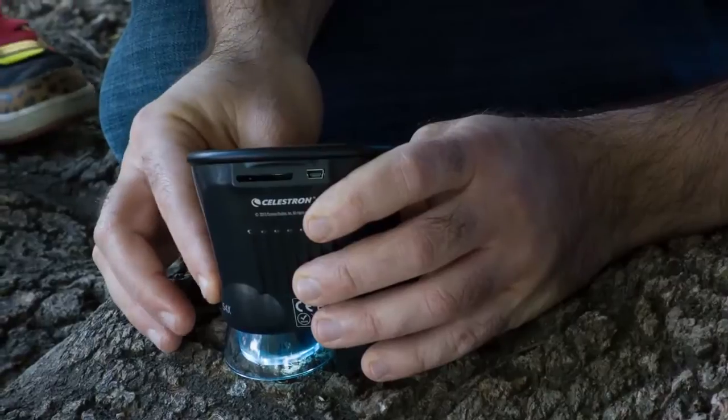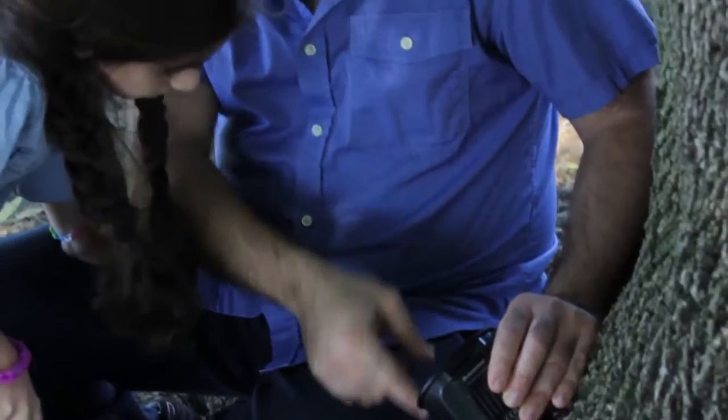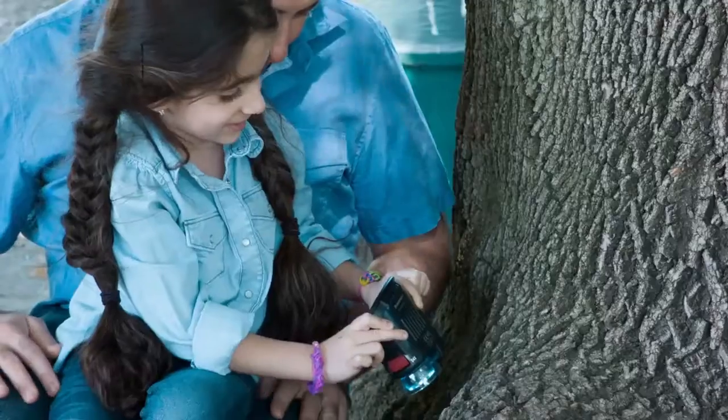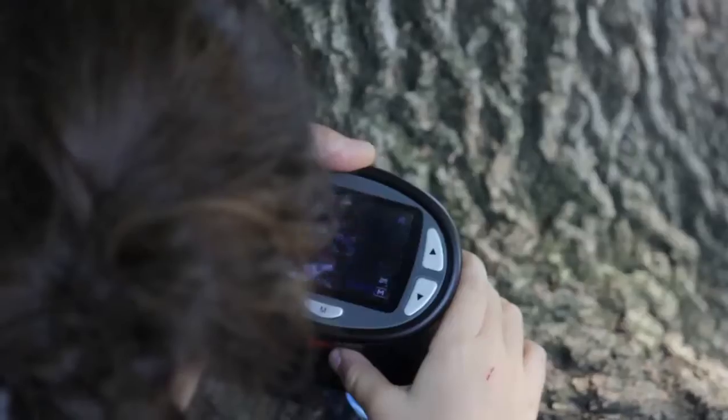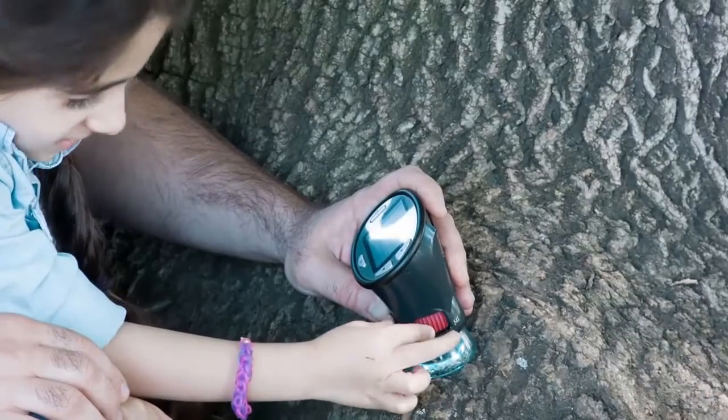This microscope is perfect for tiny specimens like insects, minerals, and plants. An onboard 3 megapixel sensor allows you to capture still images and video of your discoveries, which are then stored on the included 2 gigabyte SD card. Adjustable LEDs and a 4x digital zoom provide even better details.